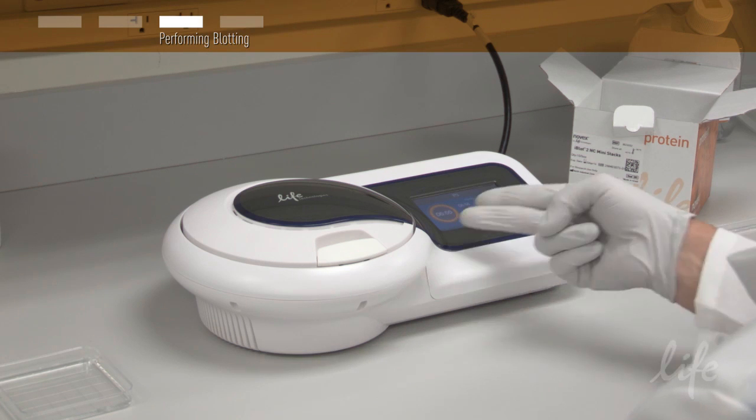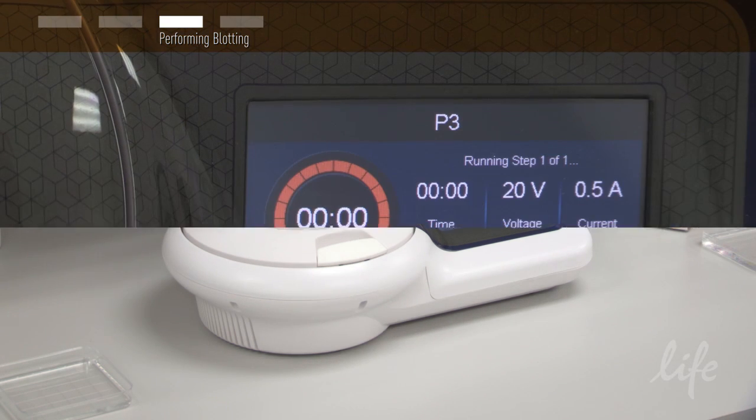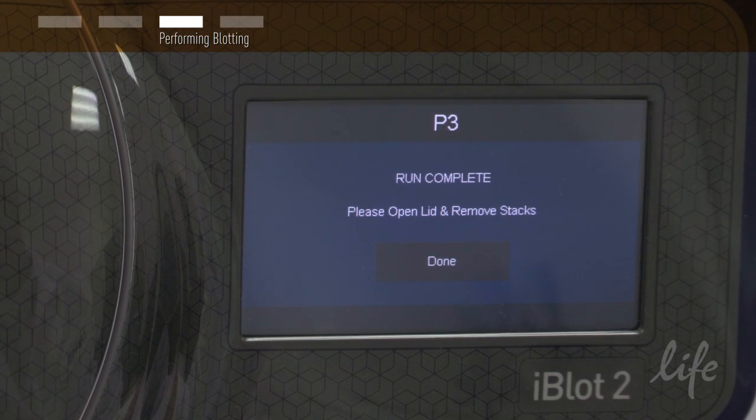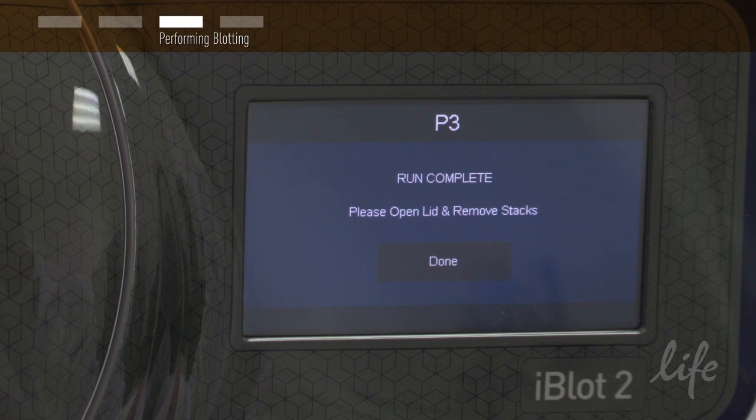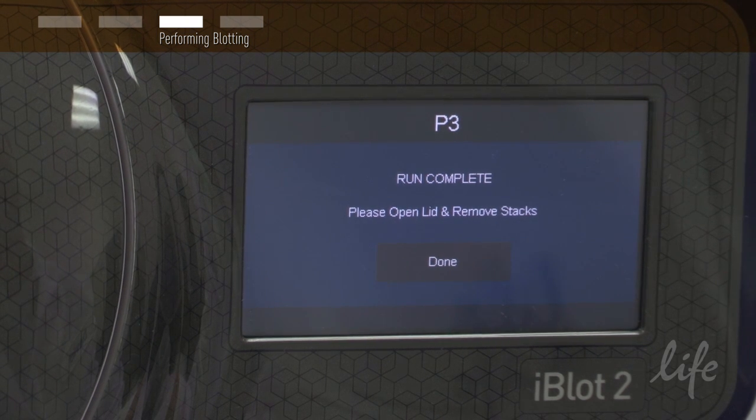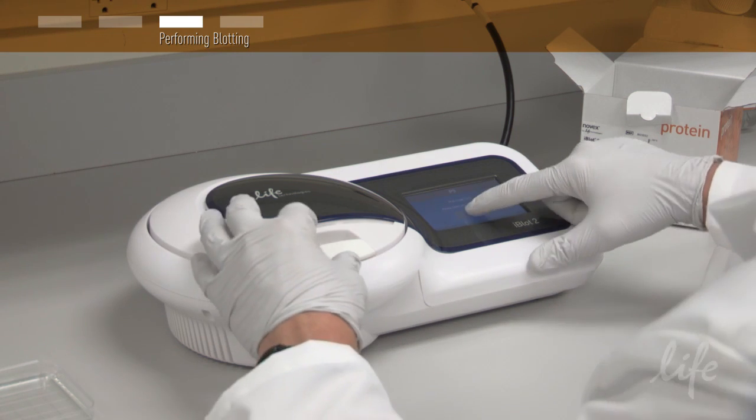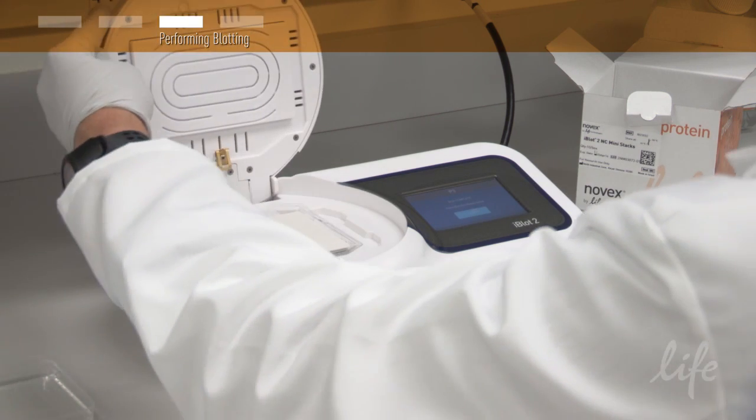Once transfer begins, the elapsed time is displayed on the screen. The end of transfer is indicated by beeping sounds and a run complete message on the digital display. Touch done to stop the run before opening the lid.